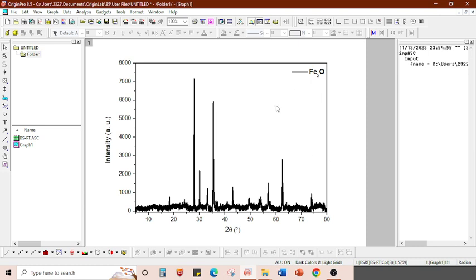So now this line corresponds to this line. If you increase the width of this line, it also increases the width of this line. Now I've just shown the outer frame, how to make it, how to keep everything. There is one more thing. If you want these to also be bold, you can just click bold. And if you want to change the font, decrease it or increase it, you can do it here. Personally, I like to have these bold because when you export it, it has a very clear look.